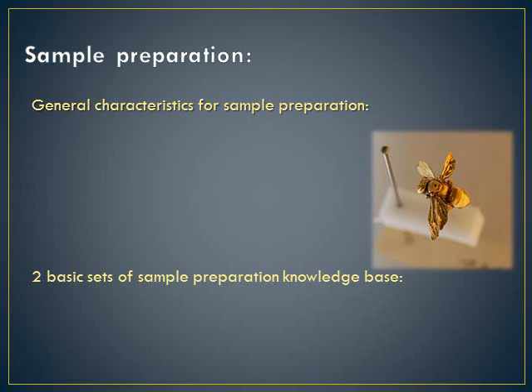Before we start preparation of our sample, we need to make sure we know exactly what information we intend to get during the SEM evaluation. For SEM, a specimen is normally required to be completely dry since the specimen chamber is at high vacuum.